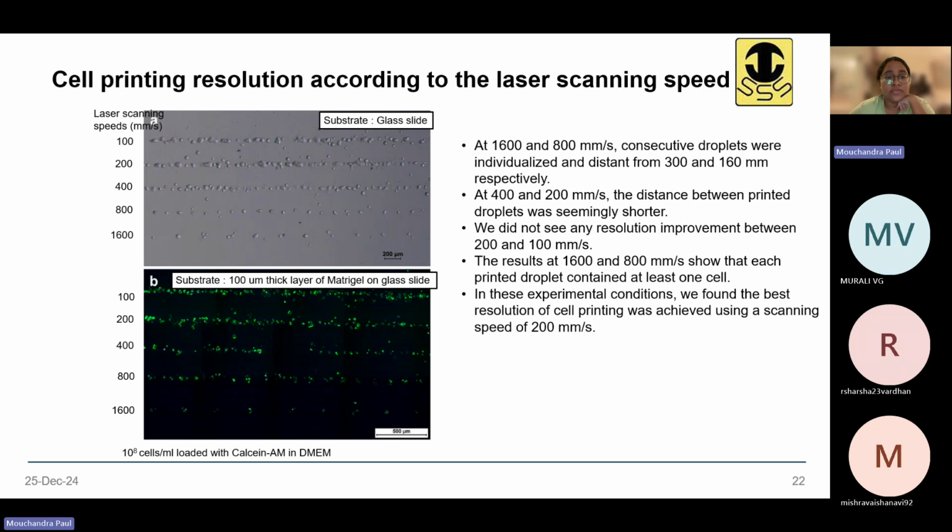So what's happening, if you can visualize, the laser is coming, right? You just switch it on and switch it off, that's it. But as the mirror is moving so fast, much less of the laser energy, or the photons, yeah, laser has photons, so much less photon particles are getting reflected by the mirror. So much fewer coordinate points will get targeted over the ribbon.